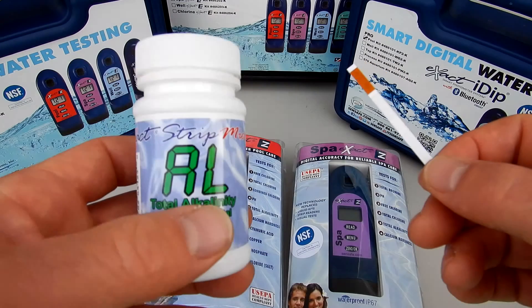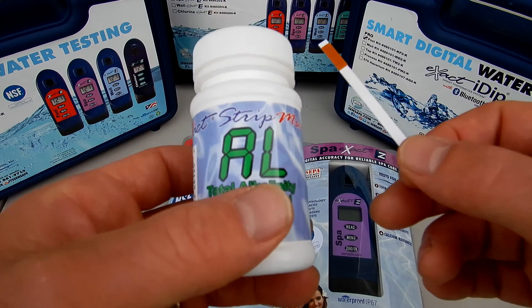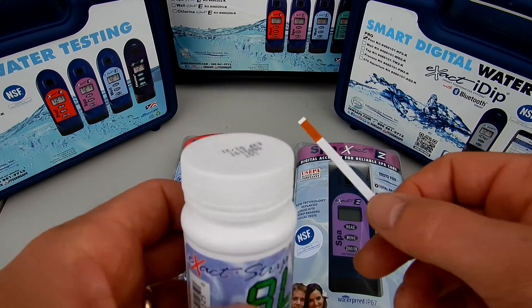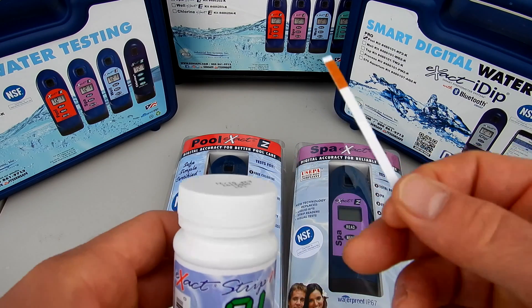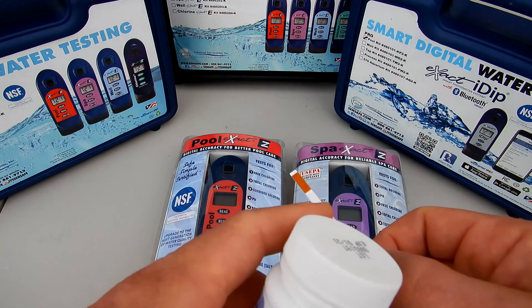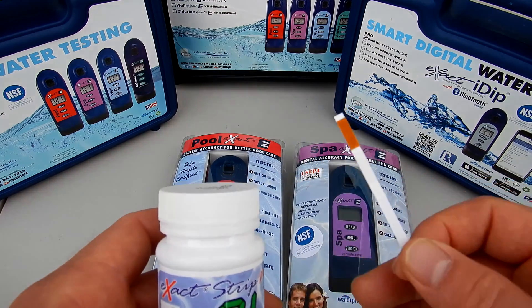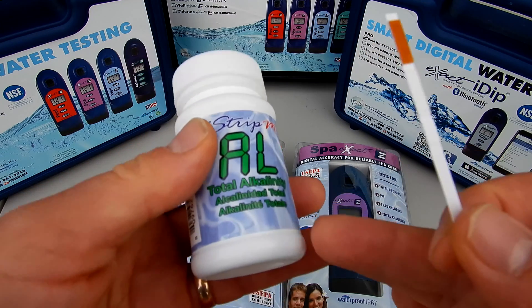Most of the testing by the exact photometers is done with these exact strip micros. These are specially formulated strips with the reagent on them — they are not like regular standard test strips. Each strip has been factory made with a pre-measured reagent to give the photometer the most accurate reading of whatever test factor you're checking for.